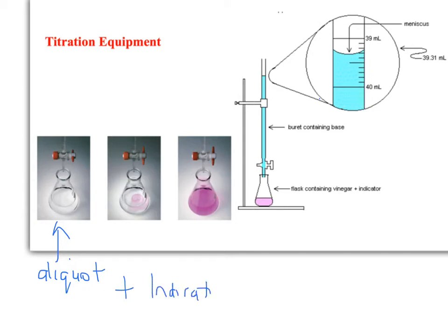We add indicator. And for our experiment we're going to be using phenolphthalein, which starts off colorless. And at the end of the titration, when you've exactly titrated the right amount to neutralize that base in the flask, it will turn pink.